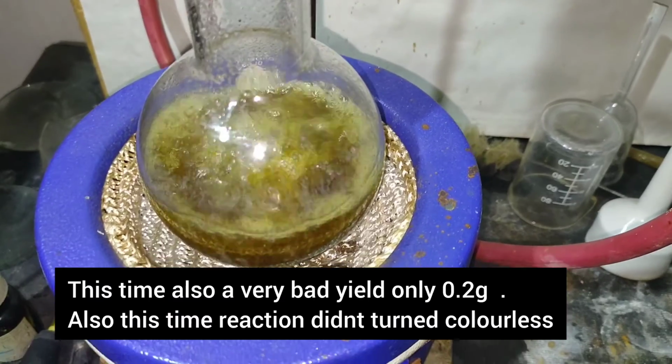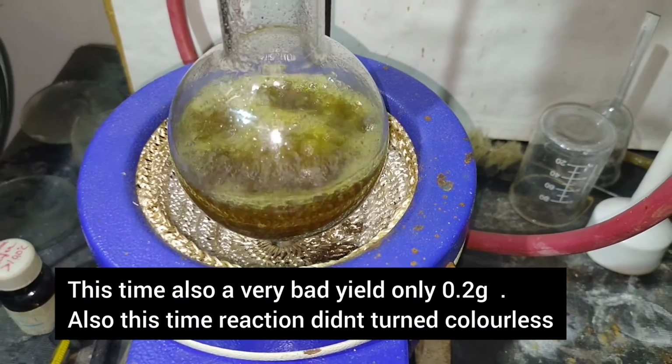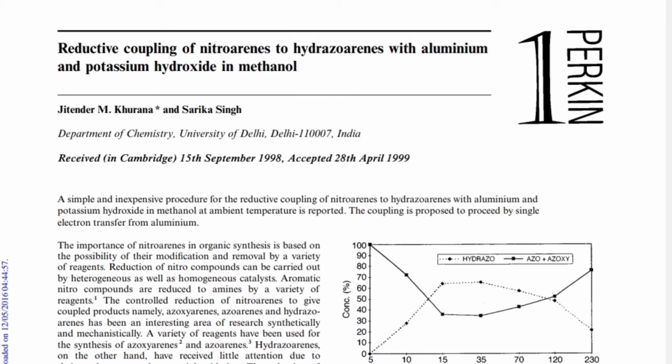I could get only 0.2 gram of benzidine. So I was just tired of making benzidine and thought of giving up or proceeding with that tiny amount of benzidine. One night I found a research paper which claims a yield of 95% hydrazobenzene.